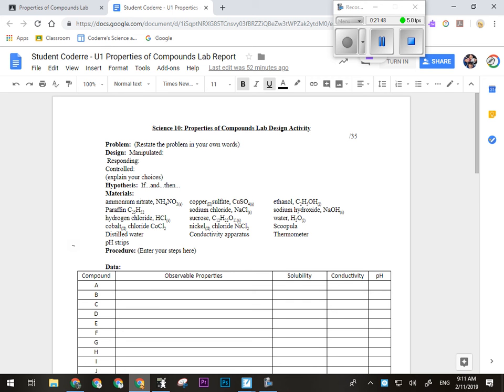You can even say grab a lab apron. You put on a lab apron and it'll give you some protection on the front of your clothes, in case you spill anything. Then you'd say, acquire the depression plate and conductivity tester, etc., from the front table or something like that. Tell them, go get your materials.